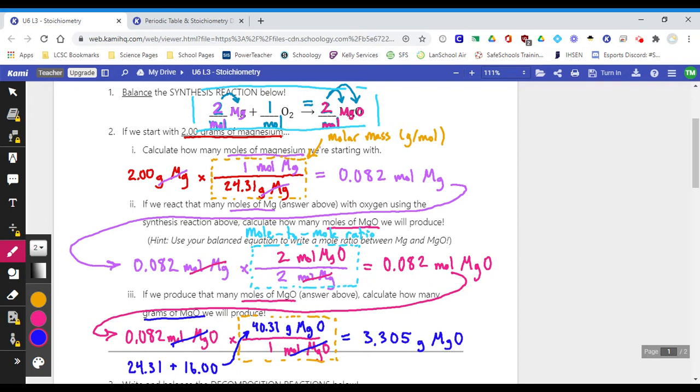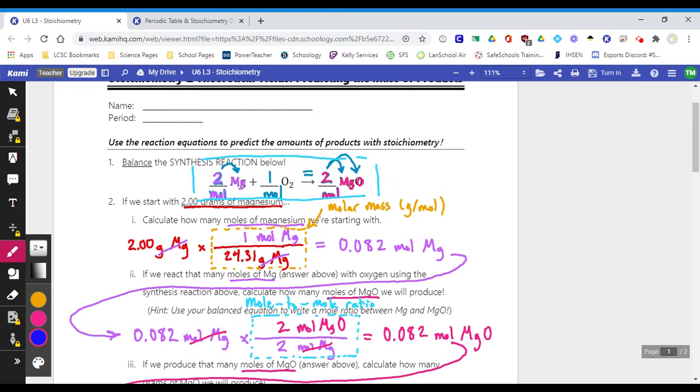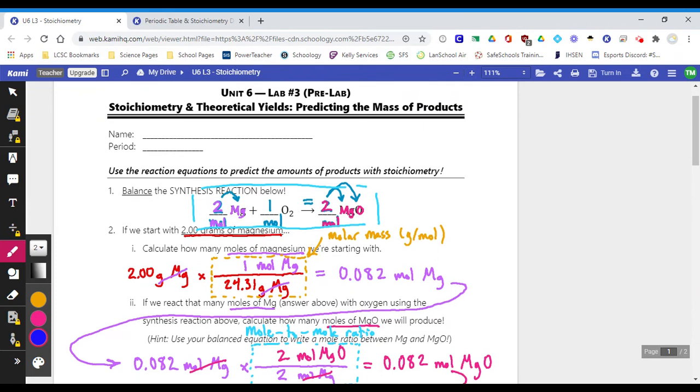And account for errors that might have happened along the way, because we are imperfect and we make mistakes. Also, sometimes it's hard to control what happens in a chemical reaction, so that also factors in as well. Okay, but that's the idea behind this. This is why we do this. It's not just so we can add another step to conversion factors and stuff.